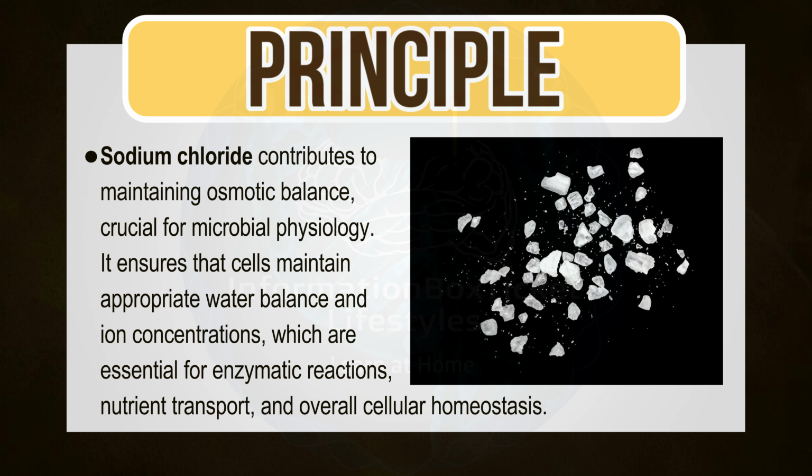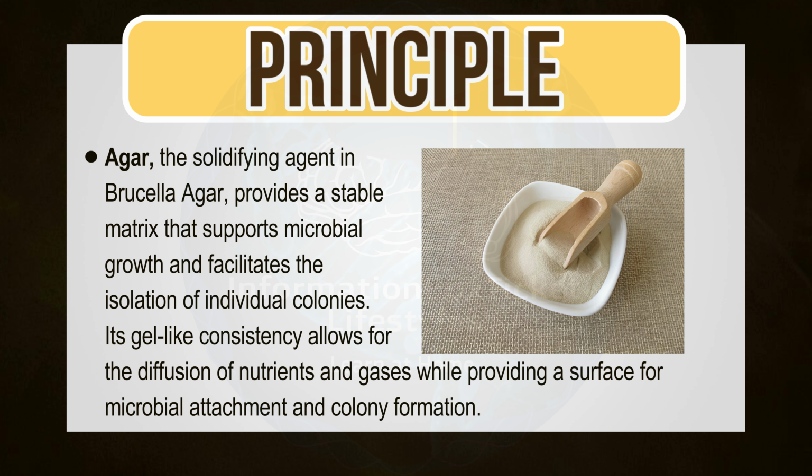It ensures that cells maintain appropriate water balance and ion concentrations, which are essential for enzymatic reactions, nutrient transport, and overall cellular homeostasis. Agar, the solidifying agent in Brucella agar, provides a stable matrix that supports microbial growth and facilitates the isolation of individual colonies. Its gel-like consistency allows for the diffusion of nutrients and gases while providing a surface for microbial attachment and colony formation.